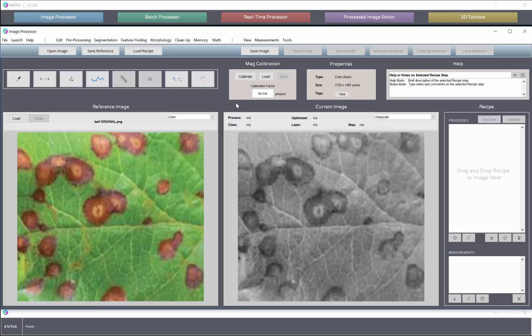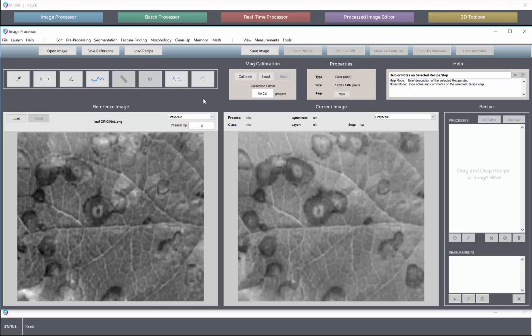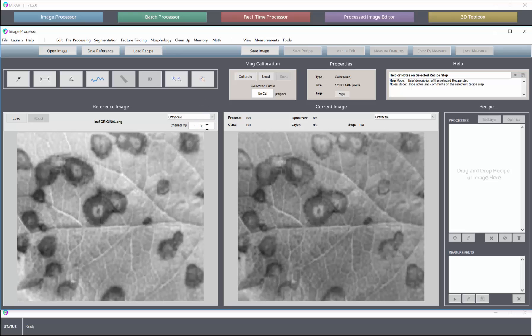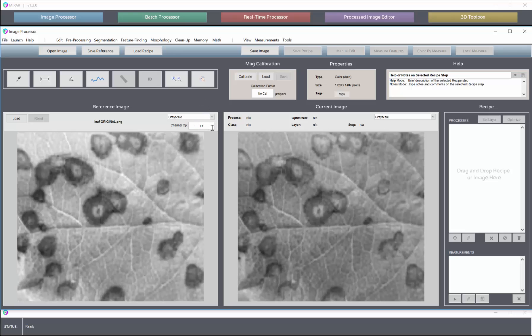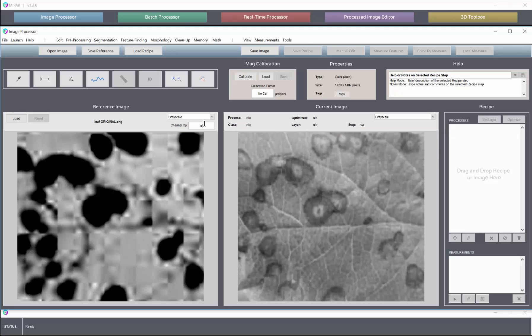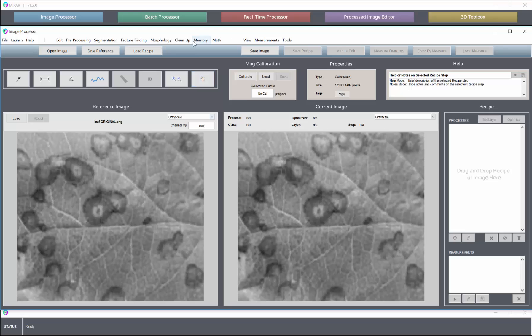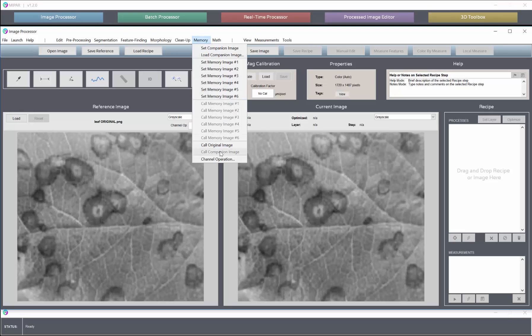With color images they're automatically converted into grayscale, and you always still have control over their channel operations. You can call those at any point in the recipe from the memory option to bring forward different color channels.